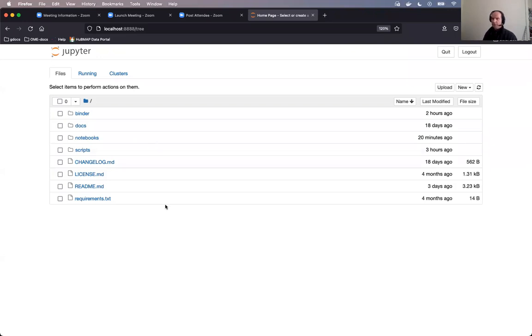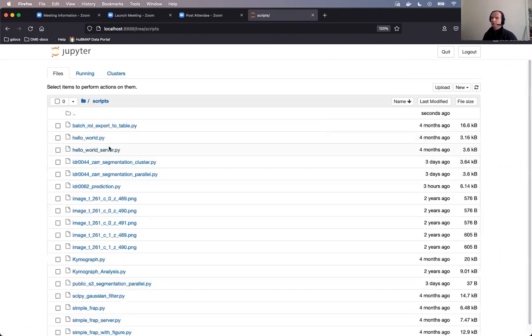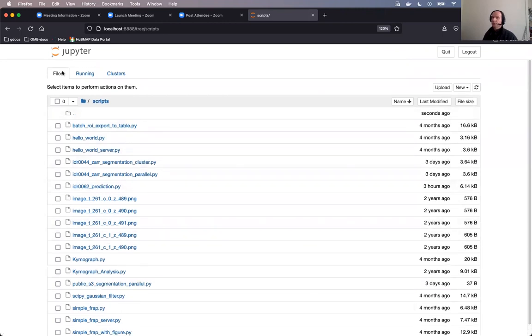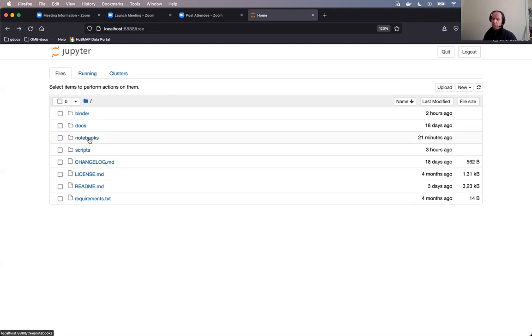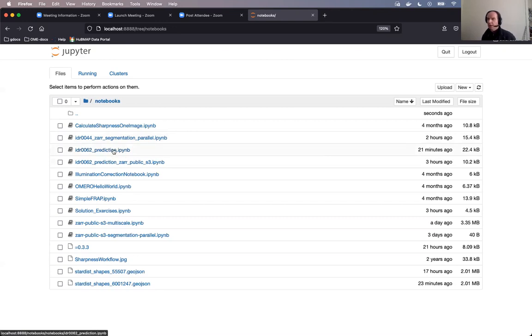So when you have built your environment, you will be presented inside Jupyter with a view like I have now on the screen, where the scripts are in the folder scripts. You can see all the Jupyter notebooks basically can be run as scripts. We also offer scripts so that you can run all the workflows inside Jupyter notebooks without needing to run Jupyter itself. The Jupyter notebooks are here for didactic purposes, and we will use them in this workshop in the folder called notebooks. And we will now use the IDR0062 prediction IPYNB.